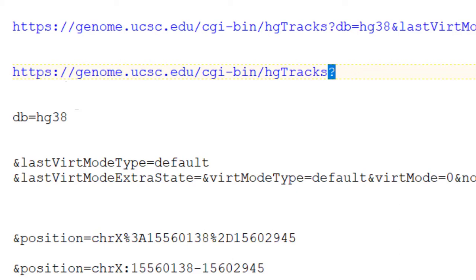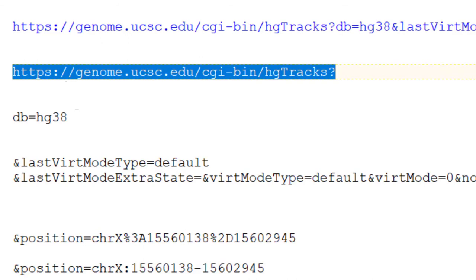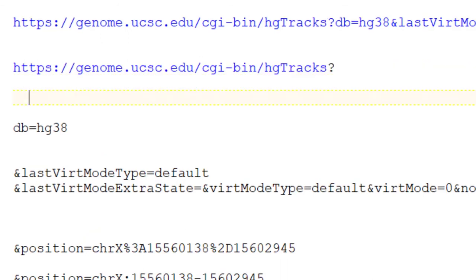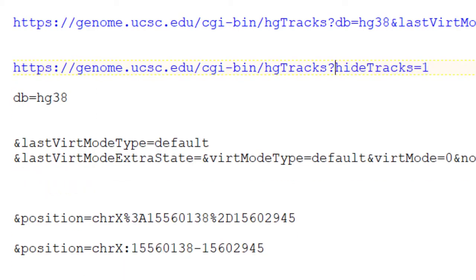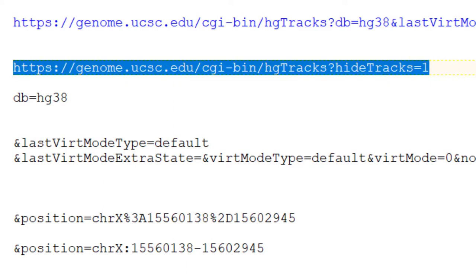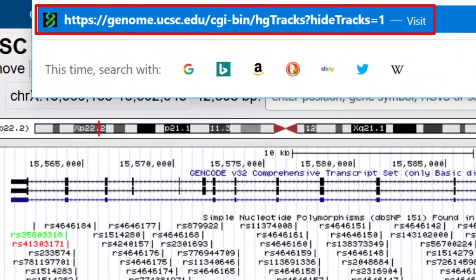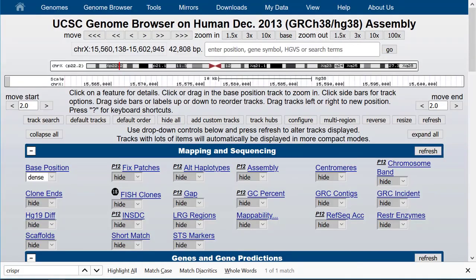Let's build a URL from the bottom up. We'll start by building a URL that turns off all tracks by adding hide tracks equals 1 to the base URL and database name, giving us genome.ucsc.edu/cgi-bin/hgTracks?hideTracks=1&db=hg38. When we use this in a web browser, nothing is showing but the base position coordinate track. All data tracks are off.